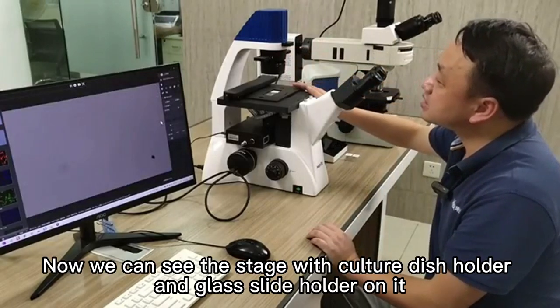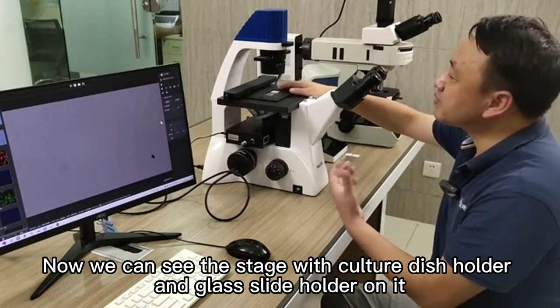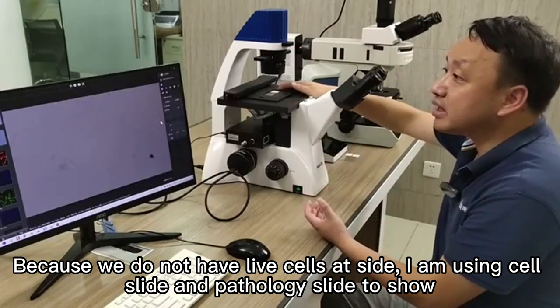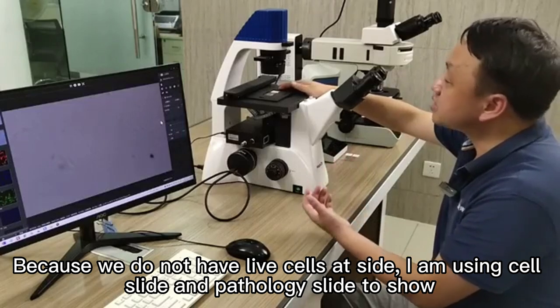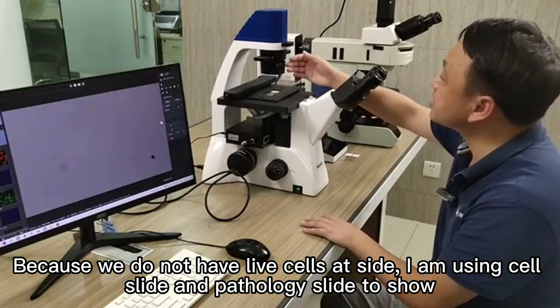Now we can see the stage with culture dish holder and glass slide holder on it. Because we do not have live cells at sight, I am using cell slide and pathology slide to show.